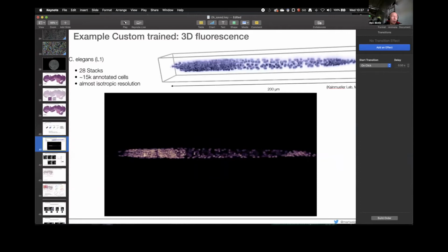And so would you say that if you annotate such an image as Anna was showing, you go all the way to the plasma membrane marker without including it, so that you then get the plasma membrane by subtraction? You could do it like this. This depends what you want to do at the end, if you want to include the plasma membrane marker in your final segmentation or not. But I think it's equally easy for the network to learn to include the membrane, these 2-3 pixels, or not. So you can do both. It depends what you annotate. Be consistent in your annotation, exactly.